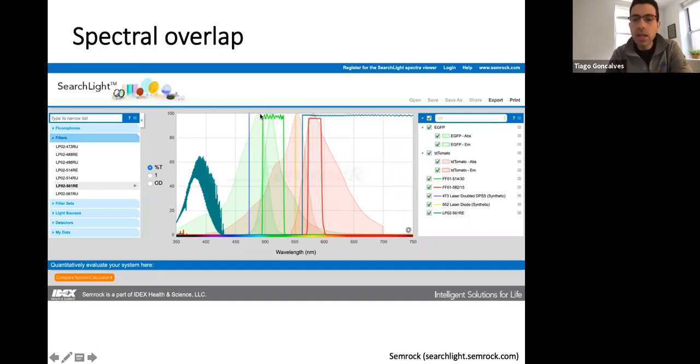Very often you can't excite your fluorophore right at the top of its absorption, and this is fine. The reason is that sometimes you're also exciting more of your other fluorophore that you have in there, or sometimes the best laser line that you have, the most powerful one, doesn't completely coincide with the maxima here. GFP, in fact, is optimized for 488 lasers, which used to be very common before. Now we have different laser lines, so it doesn't really matter if you're not exactly at the maximum.